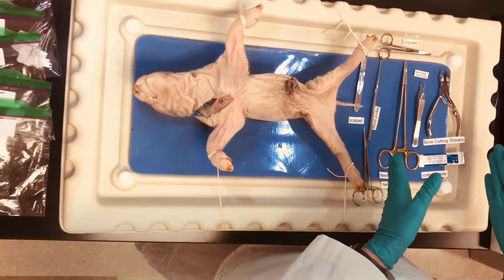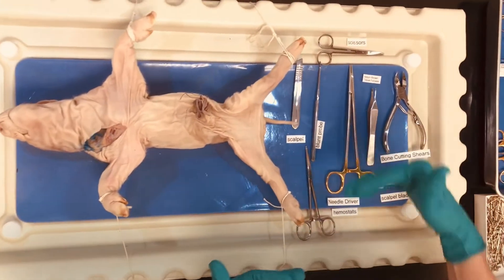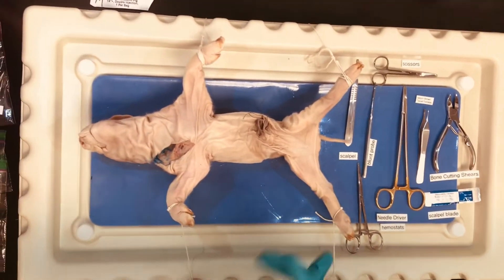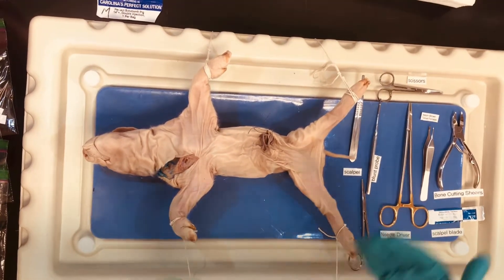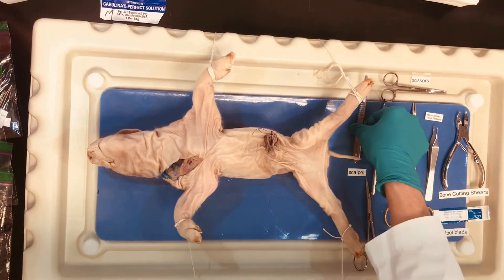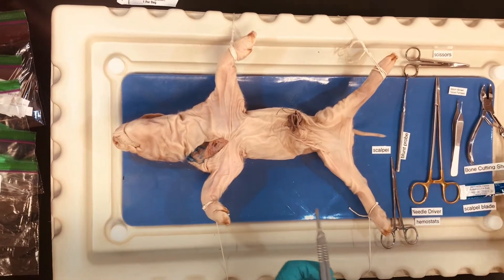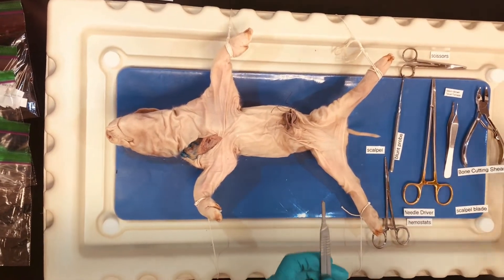It's always good to have the instruments out that you're going to be using, and we have labels here for each of those. The first thing I'm going to do is show you how to load your scalpel handle so that we can make our incisions. You are going to need your scalpel handle and then your blade.